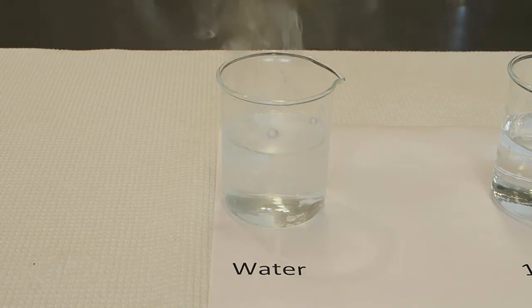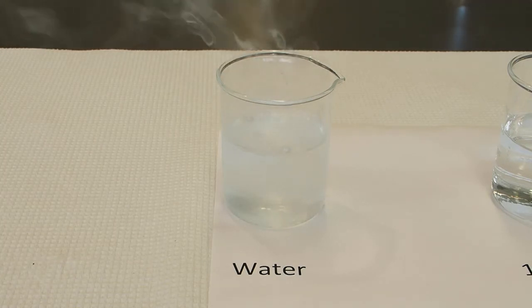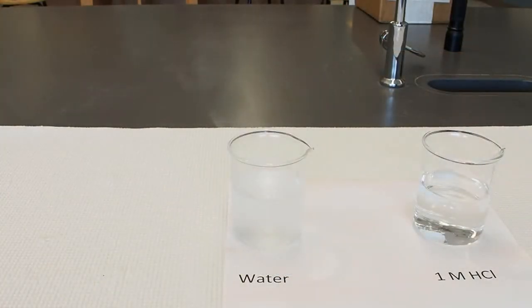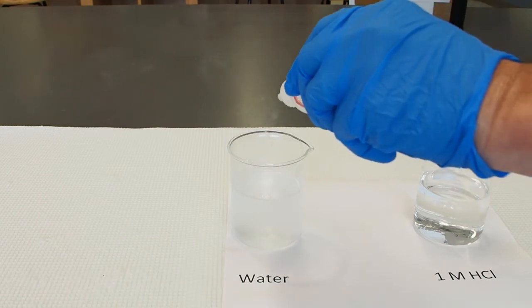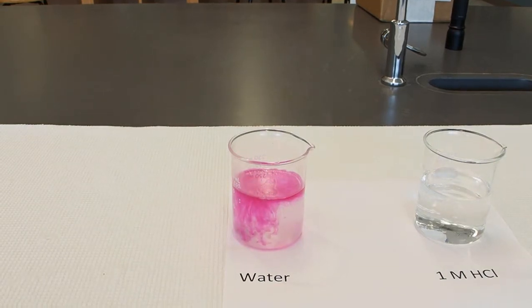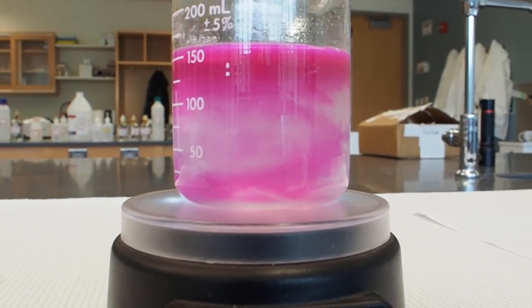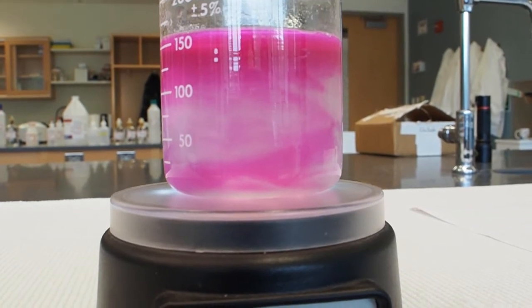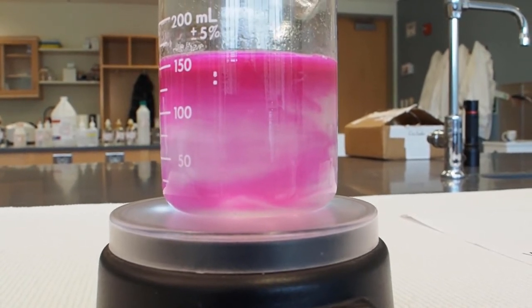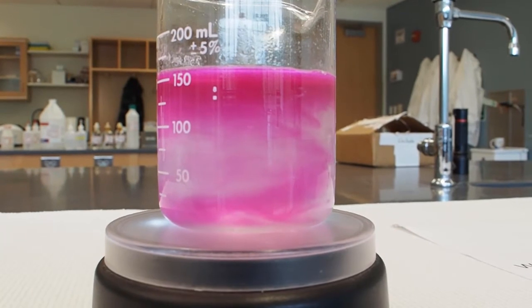And then you can see it reacts quite vigorously. It's giving off some smoke, it's bubbling, things are moving around. To test what else is being made, we're going to add some phenolphthalein in there. Notice phenolphthalein is an acid-base indicator that turns pink when it's in a basic solution. We're taking a look at the final solution, which hasn't been stirred just because it's cool looking. The phenolphthalein we added has turned pink, and that's because one of the products of the reaction was hydroxide ion. Next we're going to take a look at what happens with magnesium.